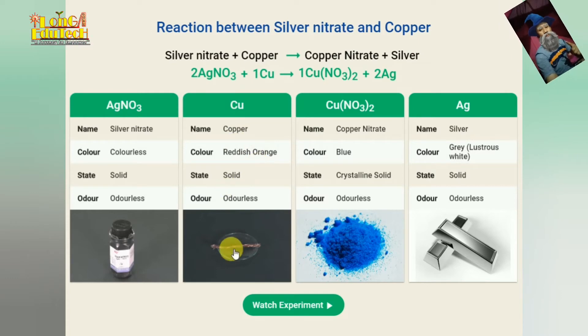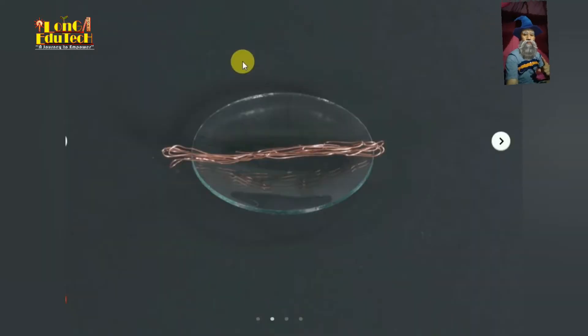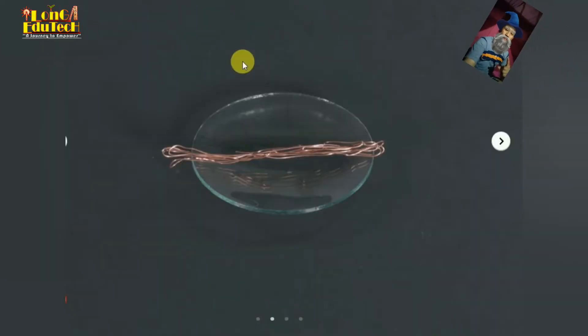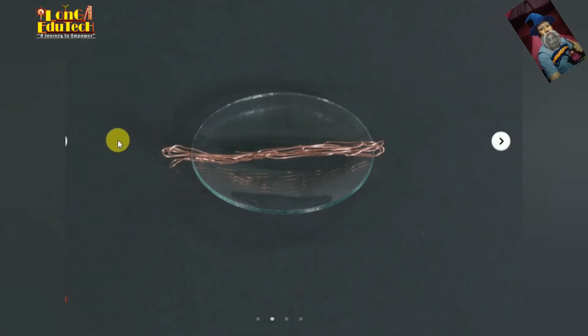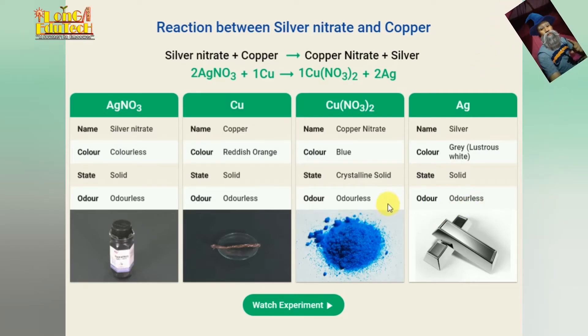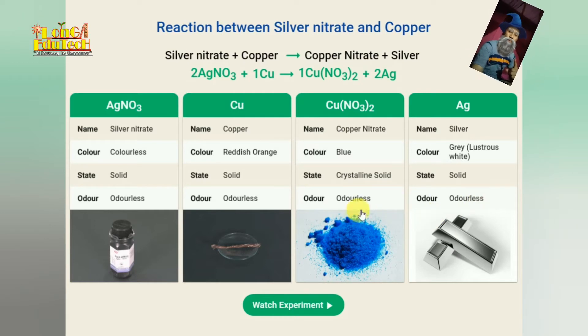Copper, as you know, is reddish orange and odorless solid. This is the copper, the brown in color as we know. Now comes to the copper nitrate.